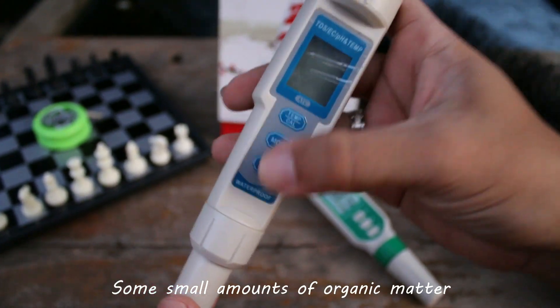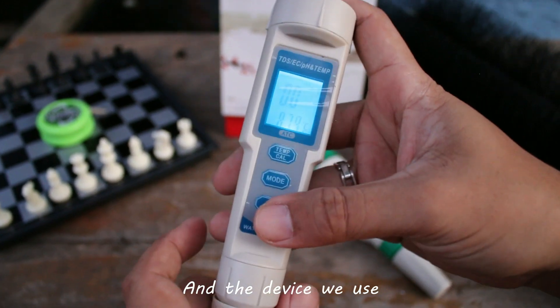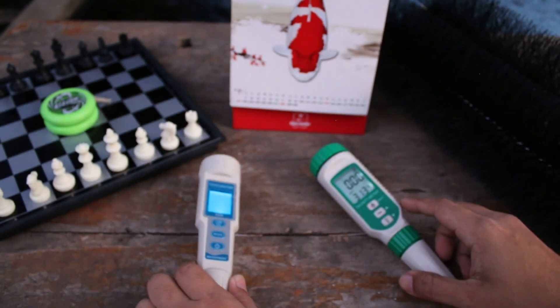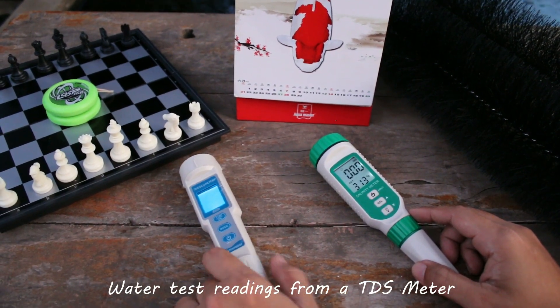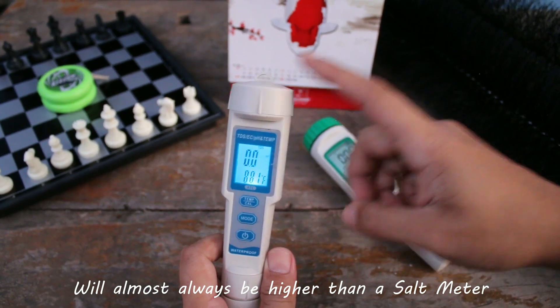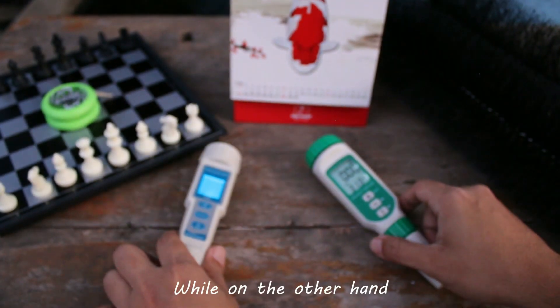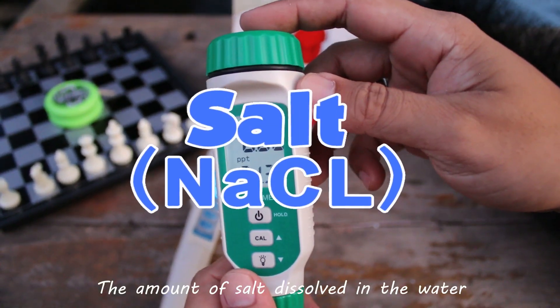Some small amounts of organic matter can also be found dissolved in water. And the device we use for checking the total dissolved solids found in water is the TDS meter. We can now safely assume that water test readings from a TDS meter will almost always be higher than a salt meter. The reason is because the TDS meter considers numerous dissolved substances in the water, while on the other hand, a salinity meter will only consider the amount of salt dissolved in the water.